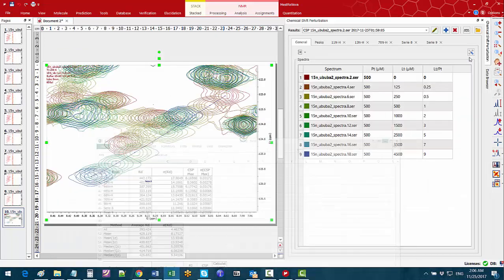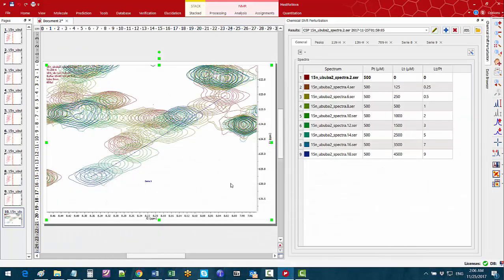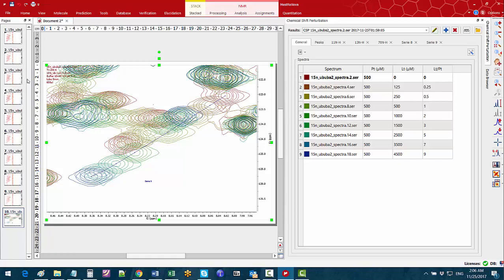We hope this demo has given you an idea on how to interactively process a protein ligand titration series to follow the peak changes, compute chemical shift perturbations and KD for each peak and eventually get the average KD.